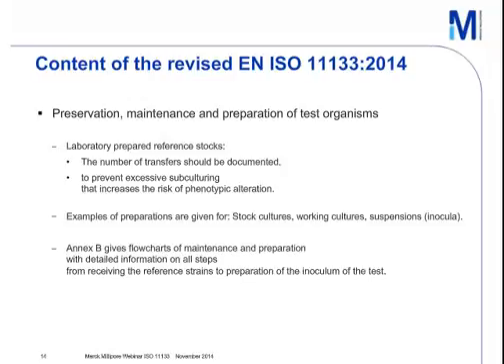For the preservation, maintenance and preparation of test organisms, detailed instructions are given. For example, for the laboratory-prepared reference stocks, the number of transfers should be documented to prevent excessive subculturing that increases the risk of phenotypic alteration. But no restriction of the numbers is given in this standard.